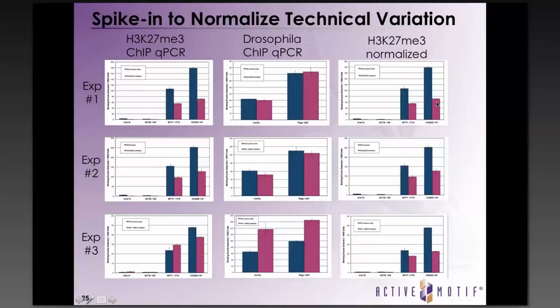So I think if you're doing multiple sample reactions and you're expecting differences, this is a good mechanism to show that those differences are real and not due to errors in processing. Additionally, if you're going to do ChIP-Seq and you're going to make the investment in generating libraries and paying for sequencing, it's worthwhile to do these quality control checks up front before you move on to sequencing.